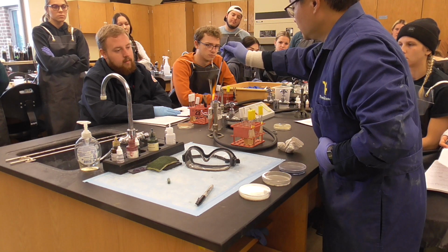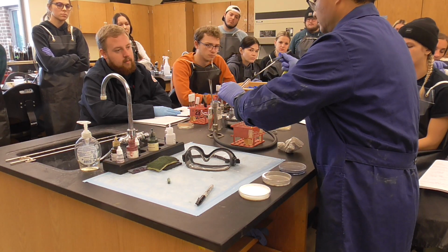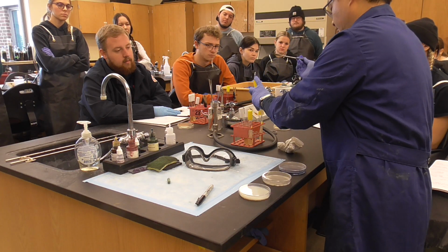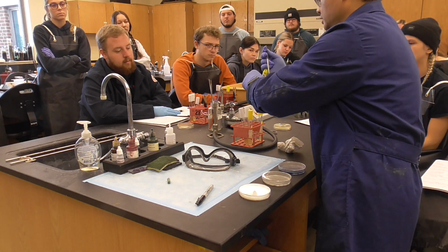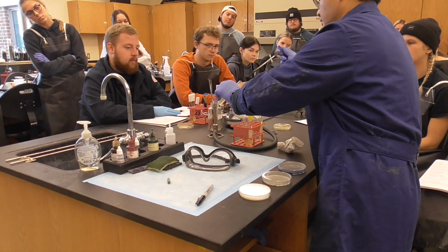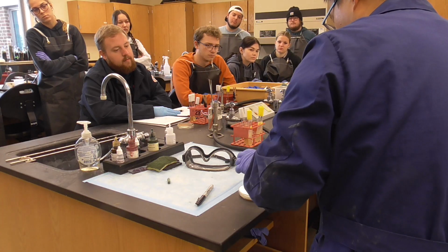Okay, now flame the loop again. We're going to do the Bacillus subtilis. So we have a Bacillus there. Touch the bacteria, and then go here, very gently. That's all. We want a certain amount, so we flame the loop between the agar plates. Then go here.